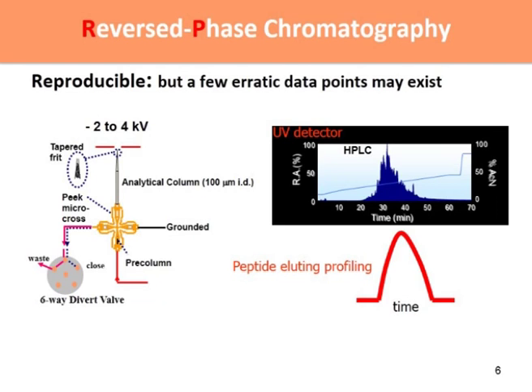When you do reverse phase chromatography, as you elute out of your column, you have different peptide species eluting at any given time, and you'll get a peptide elution profile. Say as a function of time, as you're pushing all these things through the column, you'll get some type of curve where the peptide's coming out, and then when it stops being there it goes back to zero.